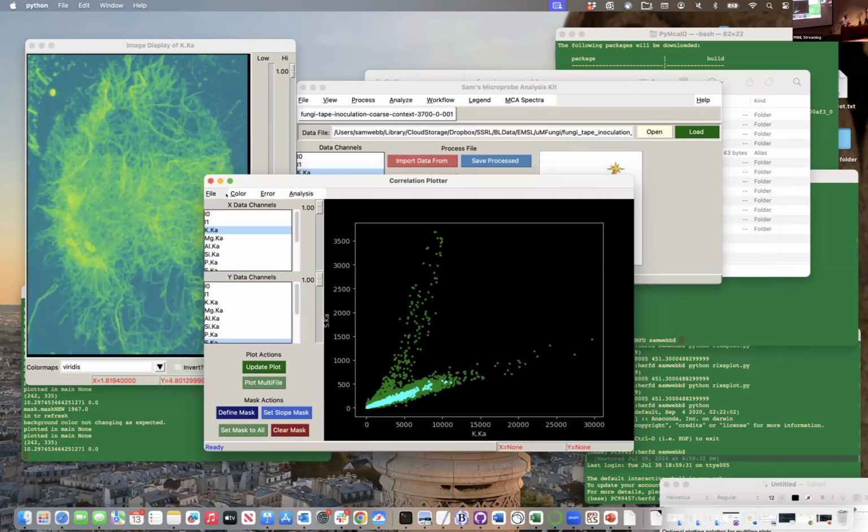And we're doing this with X-ray data, but we can all do this now with any of our modalities of individual data. So if you're doing Raman peaks, mass spec peaks, infrared peaks, we can correlate the intensities of those peaks, masses, vibrational frequencies, and do the same things here: correlate, see how they relate on the sample, and see where they are on the sample and where they are in a correlation plot too.